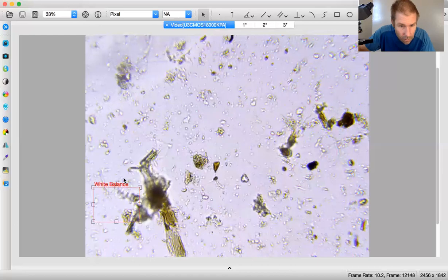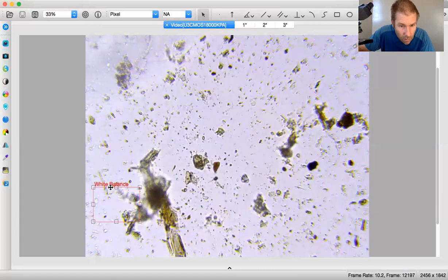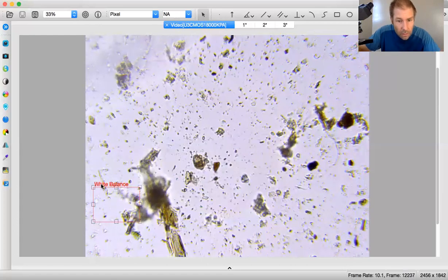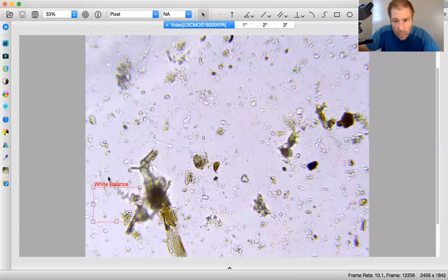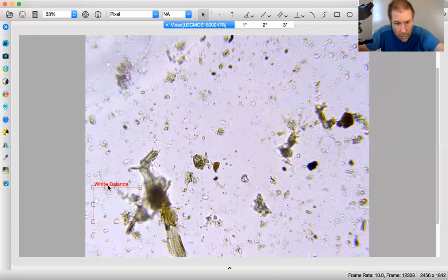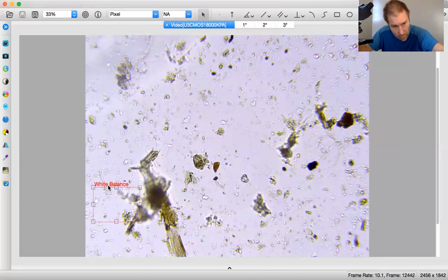And there's actually, I want to say this is actino as well, right here. So I'm going to go ahead and put that down. I'm going to call that a 0.1. It's got a little bit more if you count both those strands coming off the branches. Technically, I guess it would be a 1.25, which would be a 0.125.